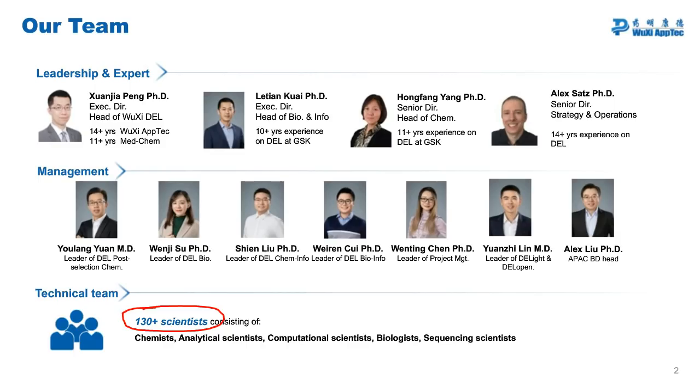Do you find hits have good ligand efficiency and lipophilic efficiency? What are the typical ranges? It's really all over, depending upon the target. With some targets, we have small, really potent hits. There've been some papers published on this, too. For other cases, for certain PPIs where the binding pockets are quite shallow, the hits tend to be larger and the ligand efficiency tends to be lower. So I would say that's not really a DEL-dependent thing. Again, that's really about the target.